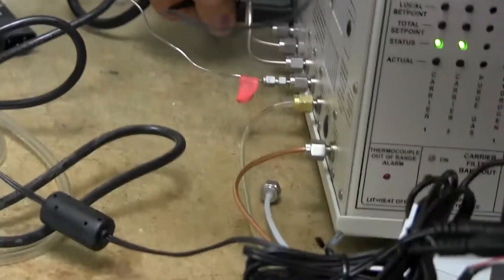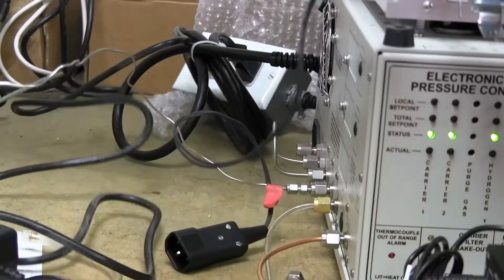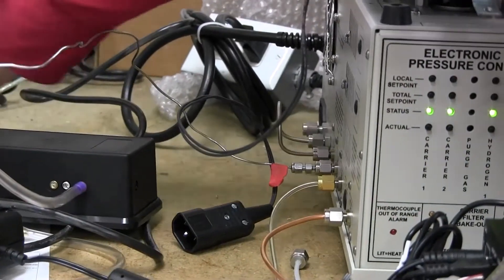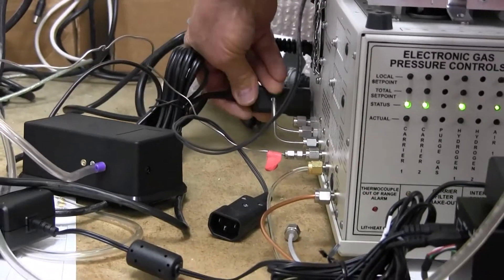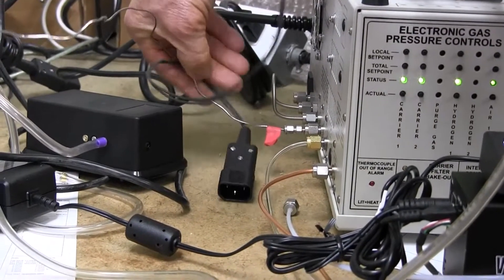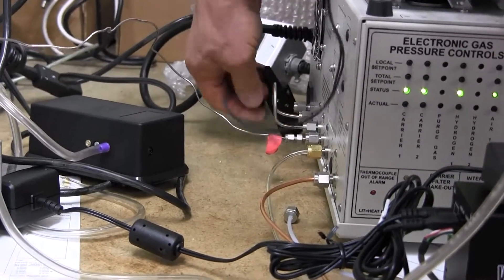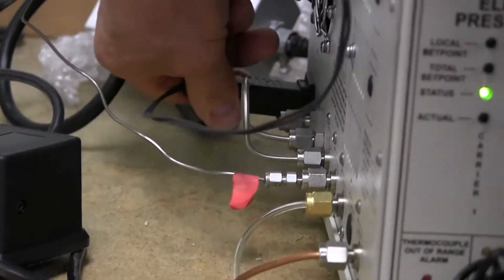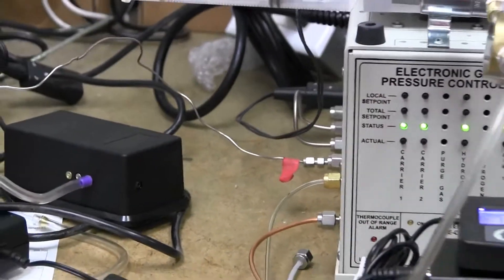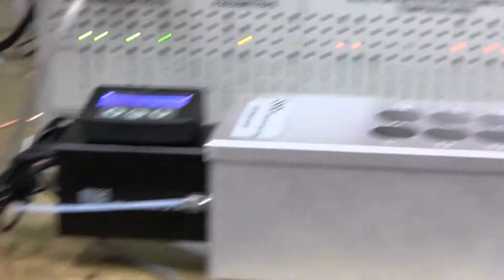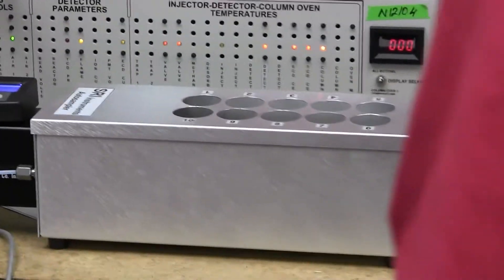So you could also plug a vacuum pump into the same thing. So it's the same power outlet that the vacuum pump would plug into is what powers this auto sampler control. Okay, so physically, that's how the auto sampler connects.